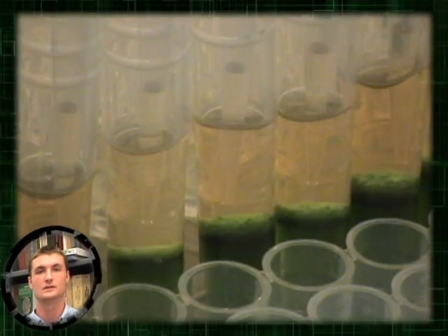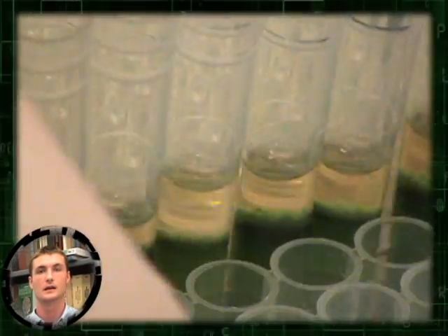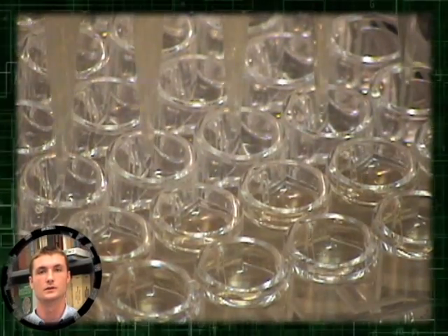When the phases are separated, the top phase will contain DNA and salts and water. This aqueous phase is then removed to a new plate.